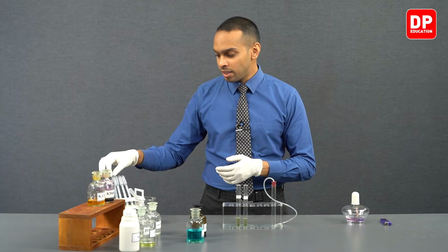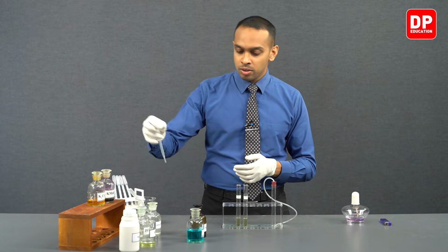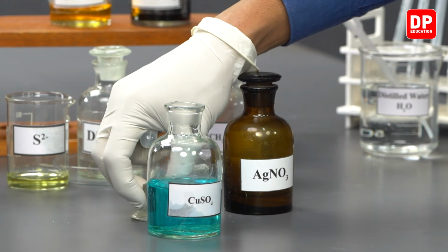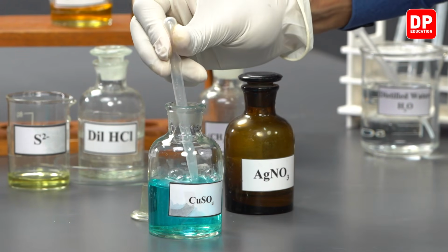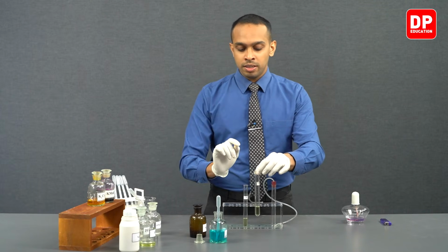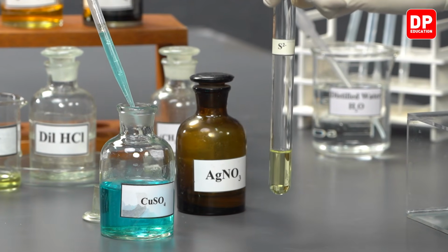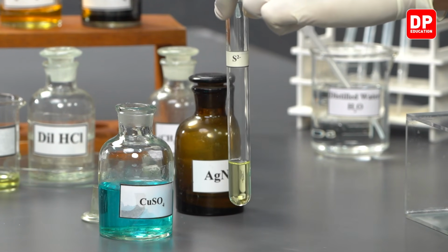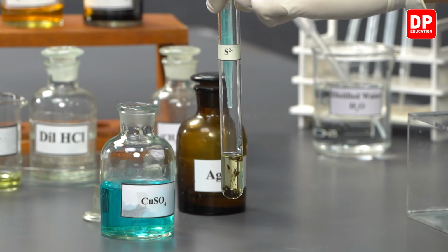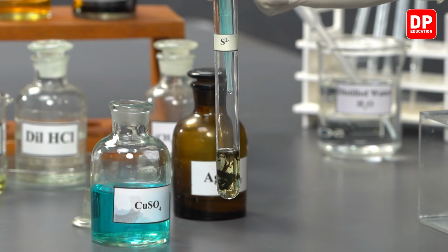So let's observe that. Let's take a small amount of copper sulfate and we can add it to our sulfide ion solution we have here. Observe what happens when sulfide ions come into contact with Cu2+ ions.